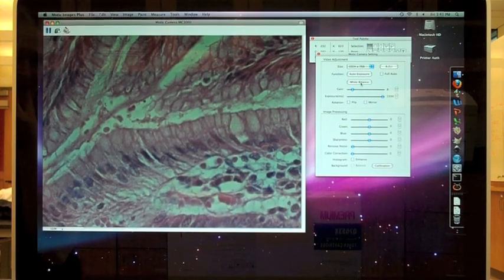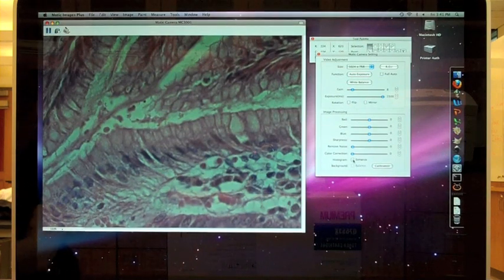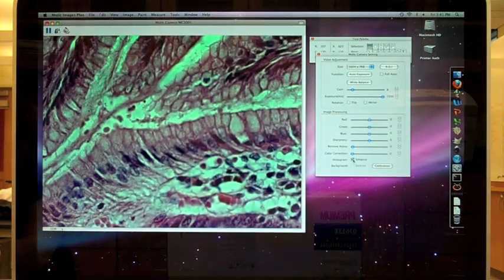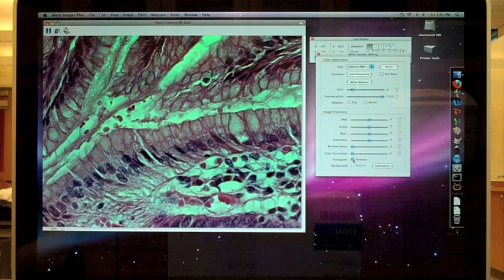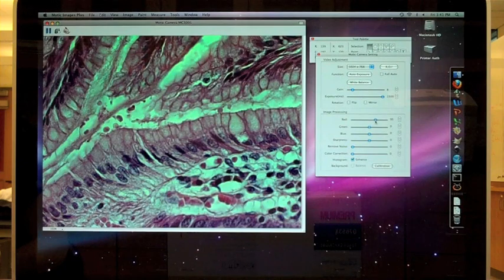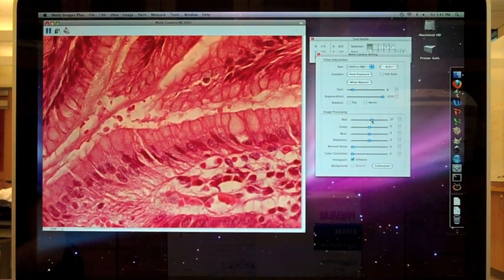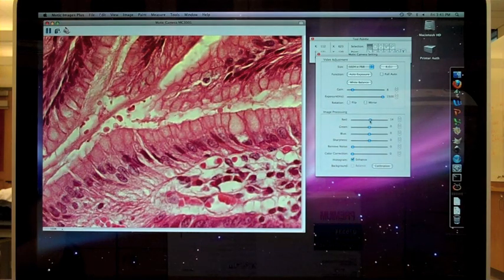Click White Balance to adjust the base color if necessary. The Histogram Enhance button may improve the color of your image. You'll want to adjust the colors to look similar to the image you see through the microscope lens. You can play around with the red, green, and blue sliders. Due to the nature of staining, you will usually never have to add any green.